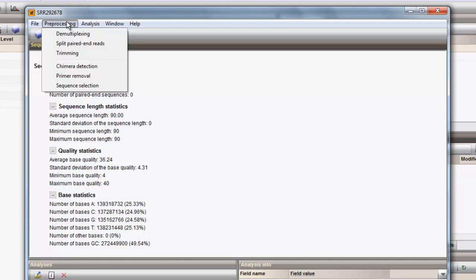As this dataset is single-end data from only one E. coli isolate, we only need the general trimming step to preprocess the data.